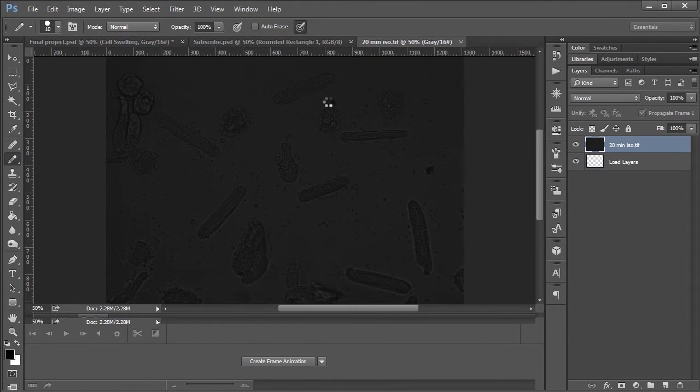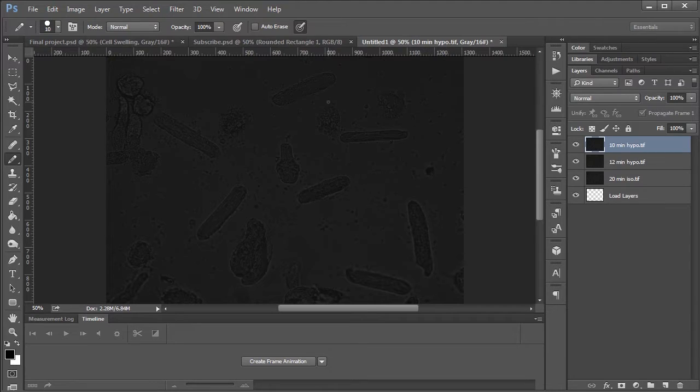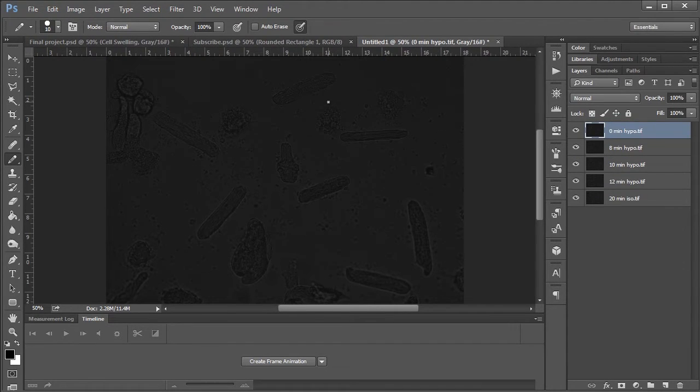And it's going to start stacking all of these files together, which is going to take a while, so I'm probably just going to edit out the dead air because I don't really want to have to keep talking the whole time. Okay, editing done. And so what we've got here is a stack of images, and the first thing you want to do is make sure that they're in the right order that you want, in which case for me they are not. So I'm just going to move this guy back up to the top because it's my first image.